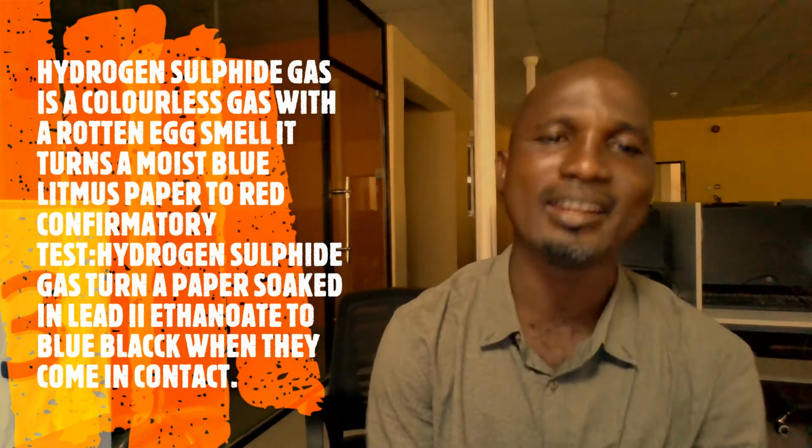Rotten egg smell. That's how to identify hydrogen sulfide gas in the laboratory. Obviously, it turns a moist or damp blue litmus paper to red, which shows that it is acidic. But that's not the confirmatory test. The confirmatory test for this hydrogen sulfide gas is when a paper that is soaked in lead 2 ethanoate is passed through the gas, it turns blue-black. This blue-black is due to the formation of lead 2 sulfide.